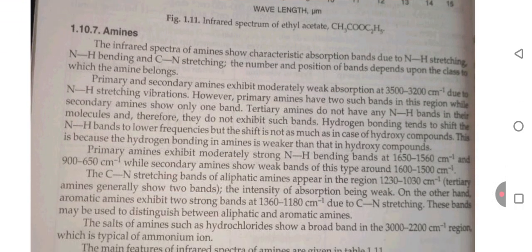Amines. The infrared spectra of amines show characteristic absorption bands due to NH stretching, NH bending, and CN stretching. The number and position of bands depend upon the class to which the amine belongs. Primary and secondary amines exhibit moderately weak absorption at 3500 to 3200 cm⁻¹ due to NH stretching vibration. However, primary amines have two such bands in this region, while secondary amines show only one band. Tertiary amines do not have any NH bond in their molecule and therefore do not exhibit such a band.